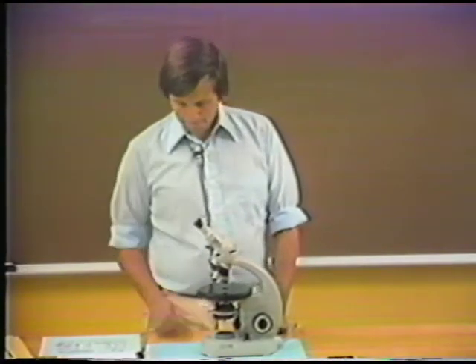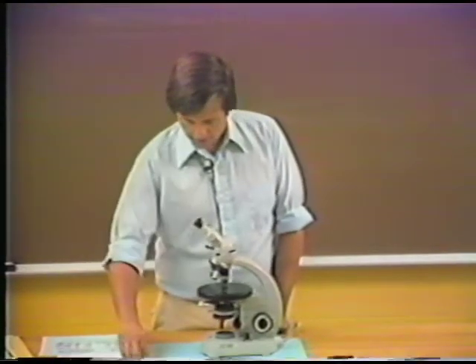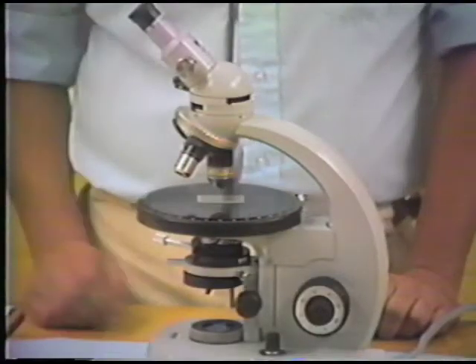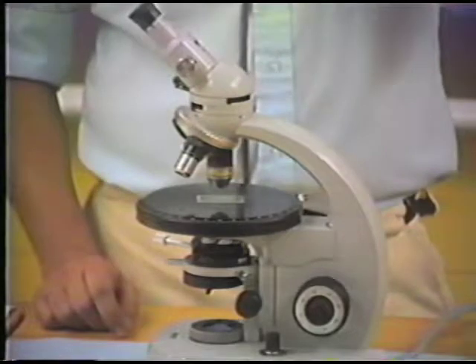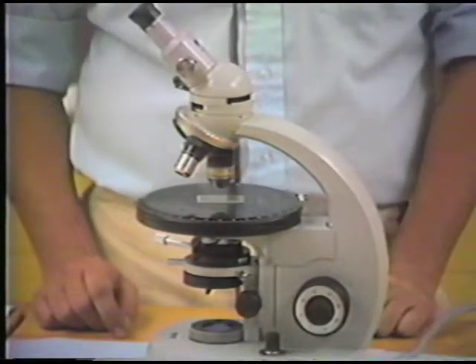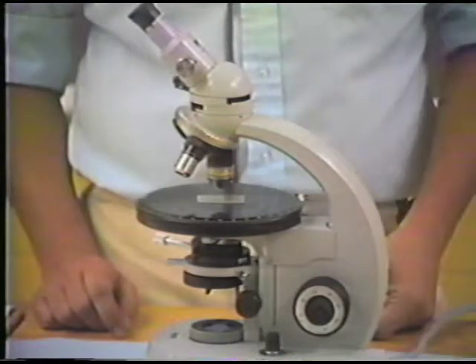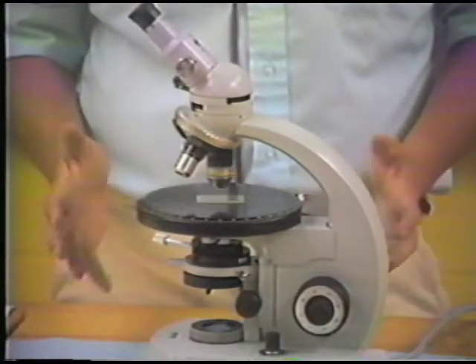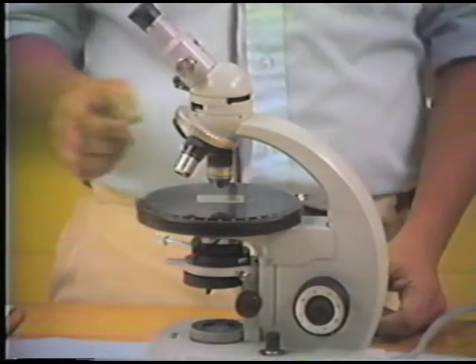To do this, then, we need a particular mount, and I'm going to start with a mount of a thin section including many crystals of the mineral quartz. Now, in preparation for the interference figure, first you have to find a large mineral grain within the field of view.